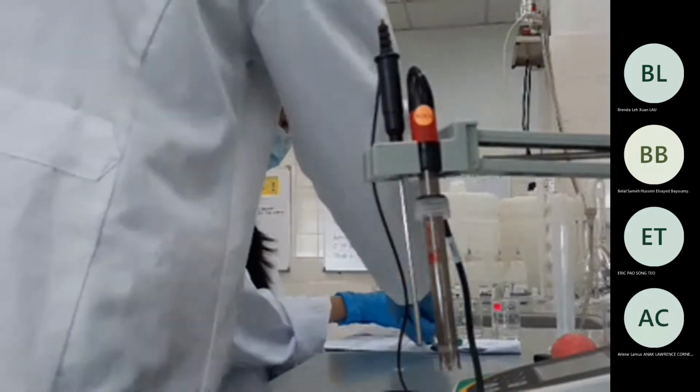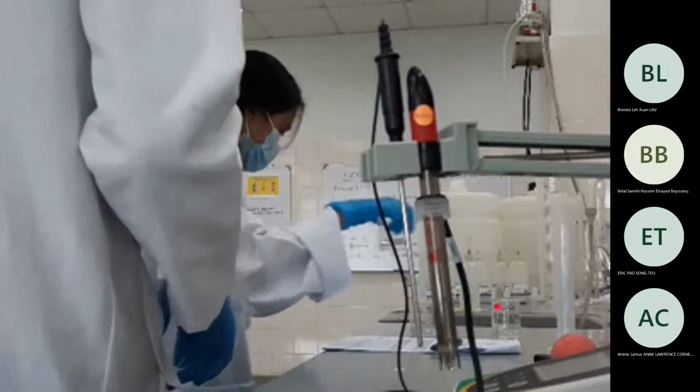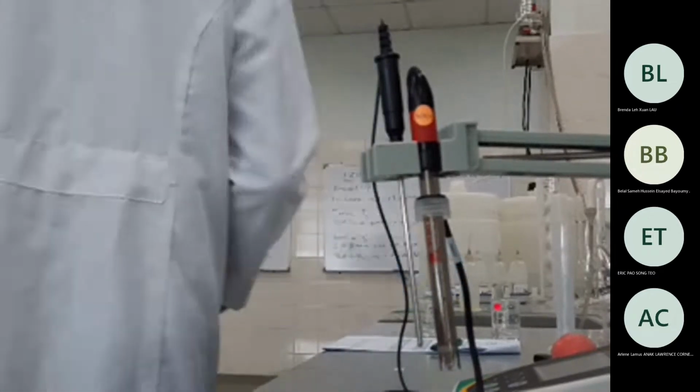So just need to add 5 drops. Hydroxide. You are taking one. Yeah.